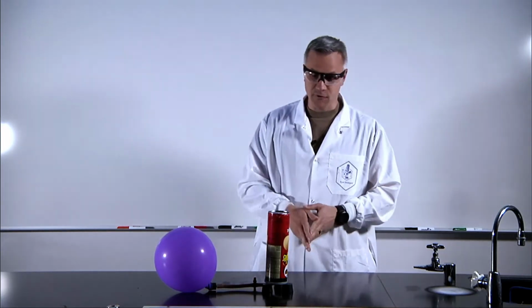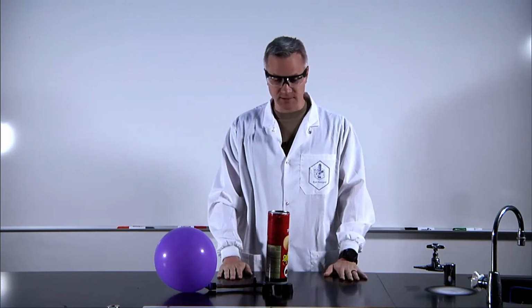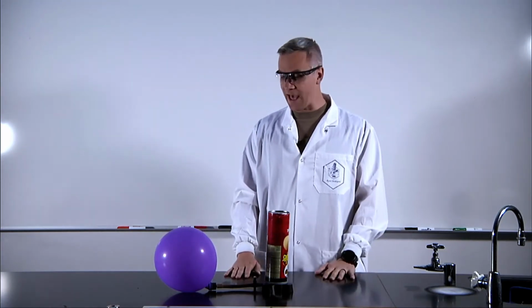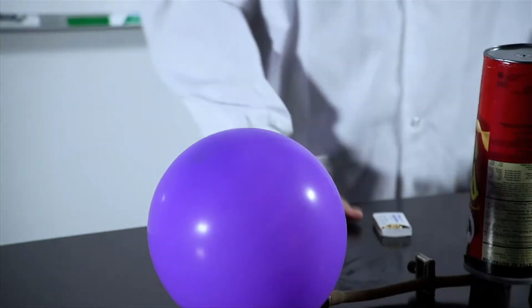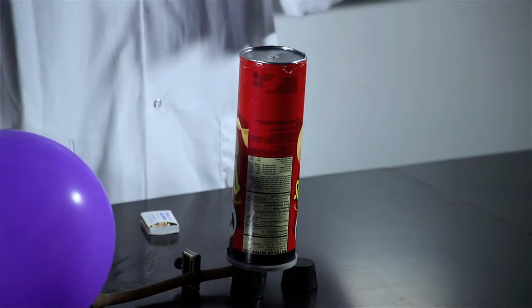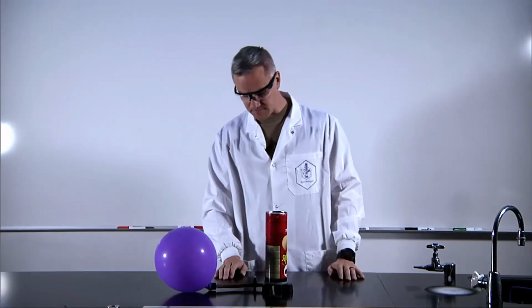So for today, what we've got for you is another demonstration of a combustion reaction. And as everybody remembers, the three things you need for a combustion reaction is the fuel source. For today, what we have is a balloon of hydrogen gas, okay? And then our standard oxidizer we're going to use for a lot of the demos is oxygen. So we have oxygen, and that's here in our can, right?